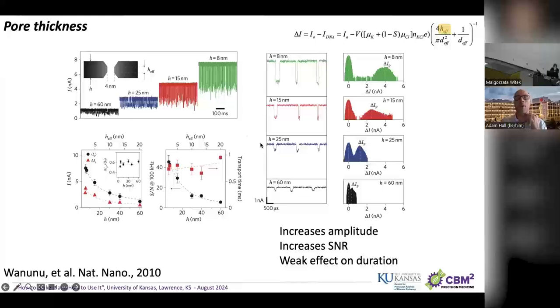So Kurshad, just to answer your question very briefly, it is exactly what you just said. It's basically how quickly those electric field lines bend. When you have a thick membrane, you can see here it's not actually a cylinder, it's more like hourglass shaped. These all have an effect on how the electric field bends. The thinner you go, the more drastic the bend in the field lines.